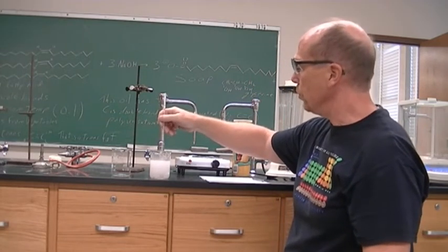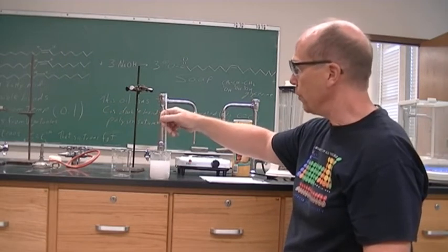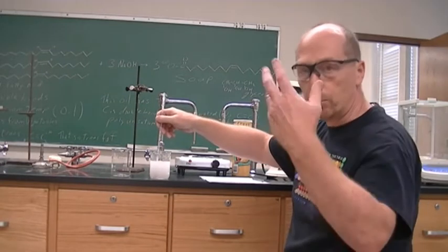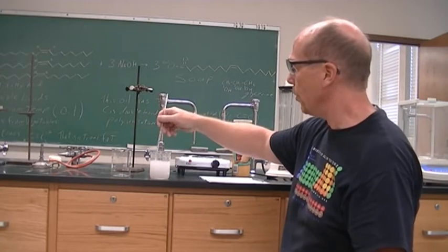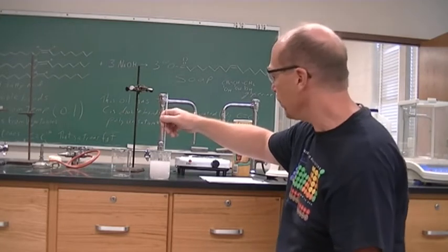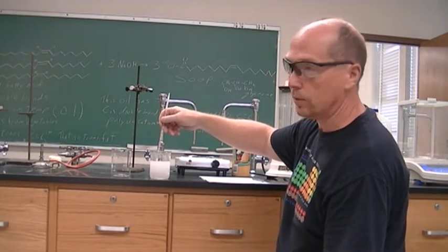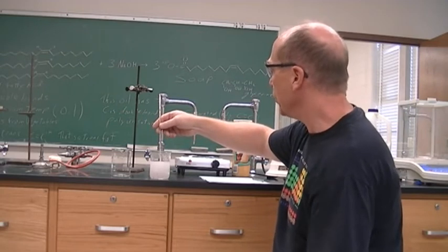It used to be you could never use your thermometer as a stirring rod, probably still a pretty good rule of thumb. But that was mainly because it would break and then mercury's everywhere. Now that they are made from alcohol, if they break, it doesn't matter, it's just alcohol. They do cost money to replace versus a stirring rod, which doesn't usually break and they are dirt cheap.